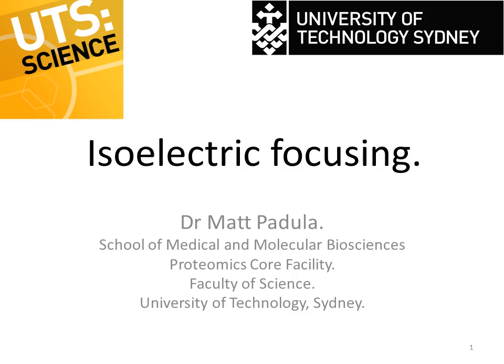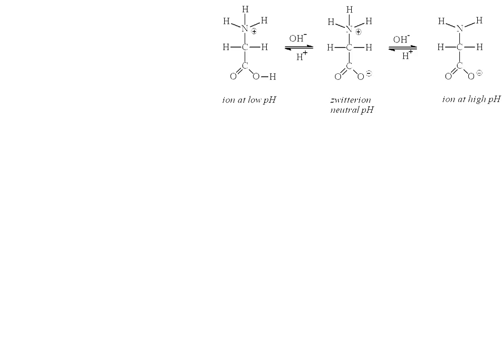In an earlier presentation we discussed electrophoresis and specifically looked at the example of separating proteins by size using SDS-PAGE. Now we turn our attention to the other main use of electrophoresis, separating proteins by their charge. As mentioned previously, proteins can exist as zwitterions, neutral molecules that can contain positive and negatively charged groups in the same molecule. In proteins, those charges normally occur on amines or carboxylic acids through the loss or gain of a hydrogen ion.